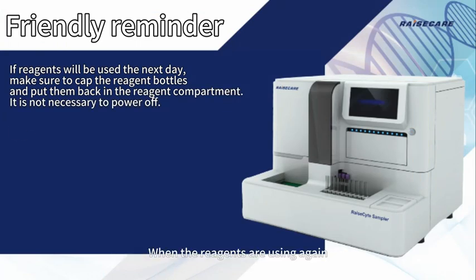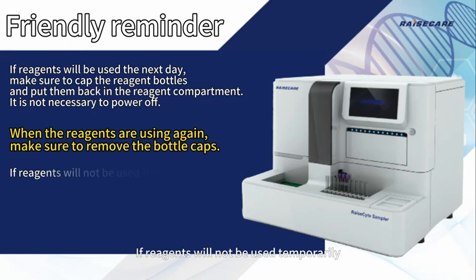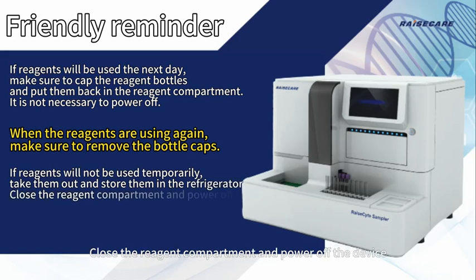When the reagents are used again, make sure to remove the bottle caps. If reagents will not be used temporarily, take them out and store them in the refrigerator. Close the reagent compartment and power off the device.